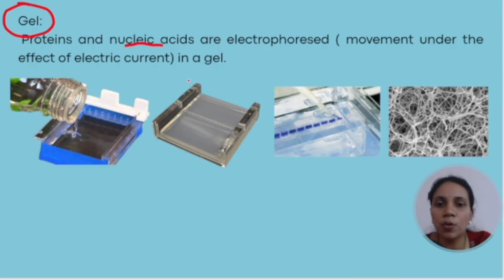And then we have something called a casting tray. If you see here, it is like a bench. Here we have a protective wall and here also we have a protective wall, with a depression here. So here also we have a depression so that we can make two lines. In our Indian labs, we normally put some masking tape over here so that when we pour this gel, it remains intact.